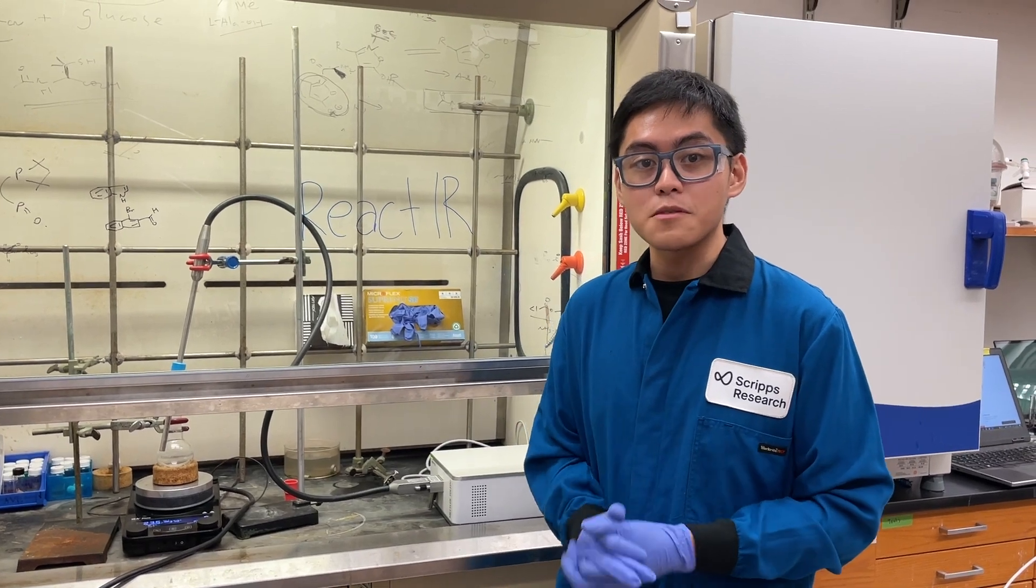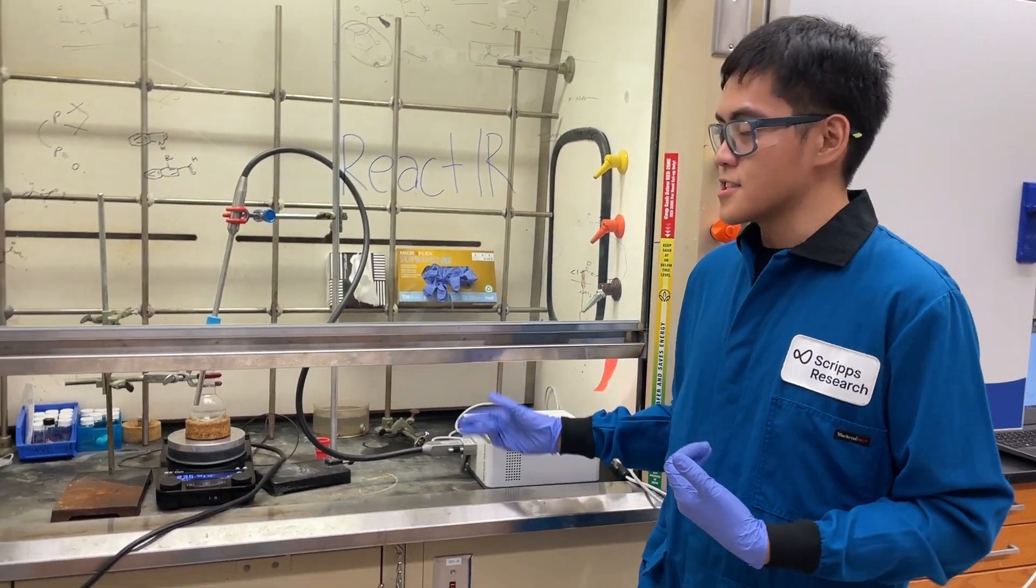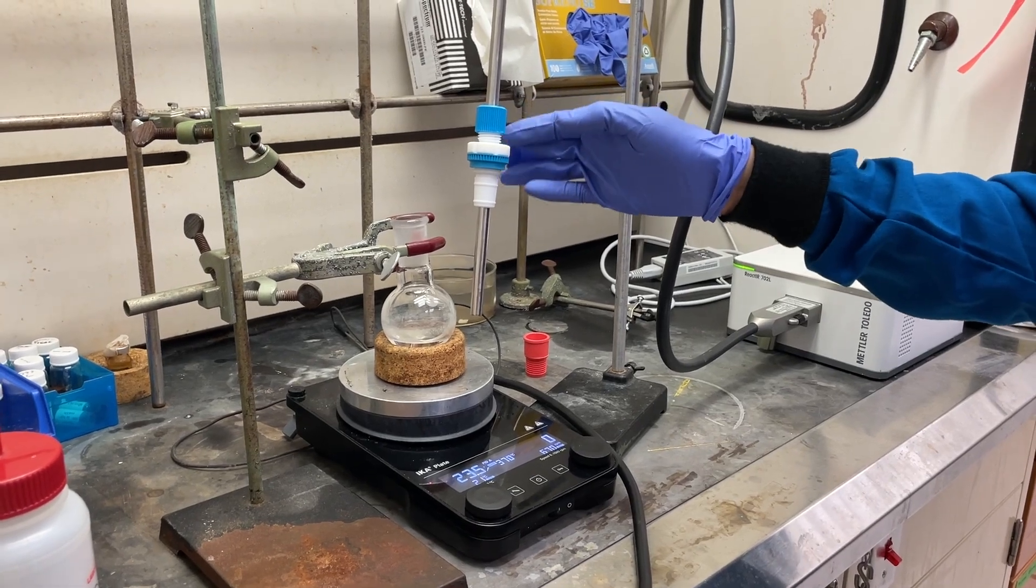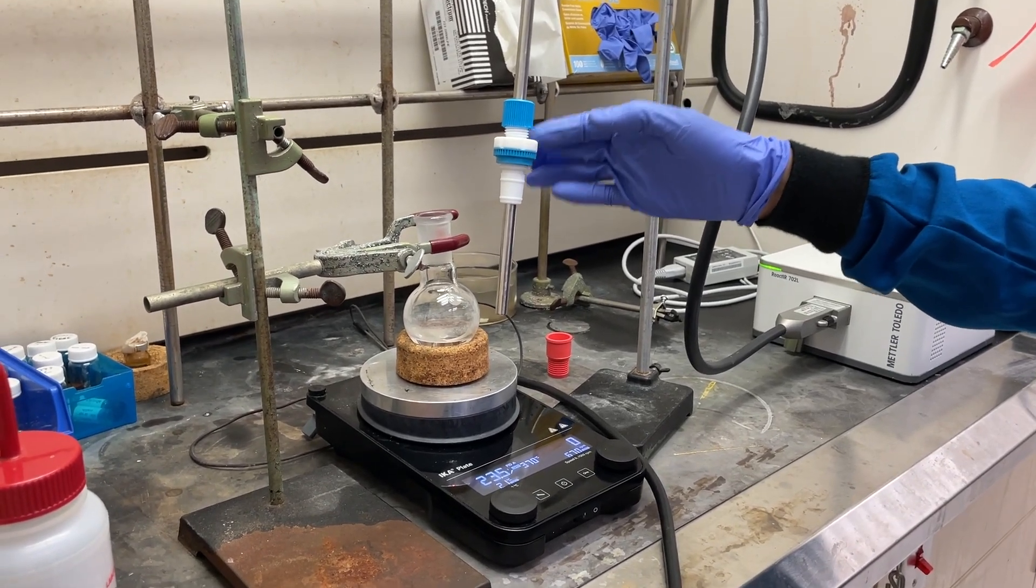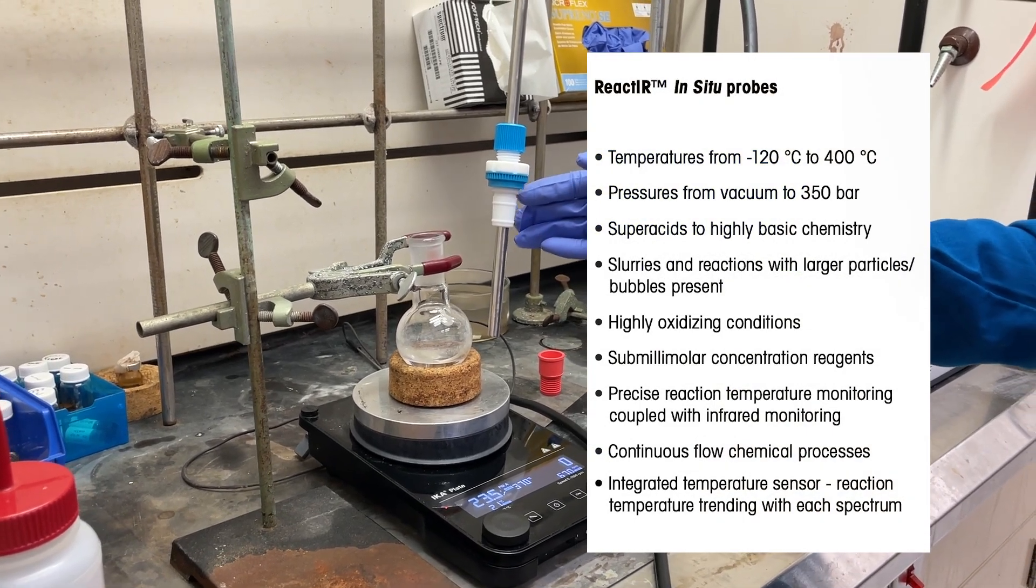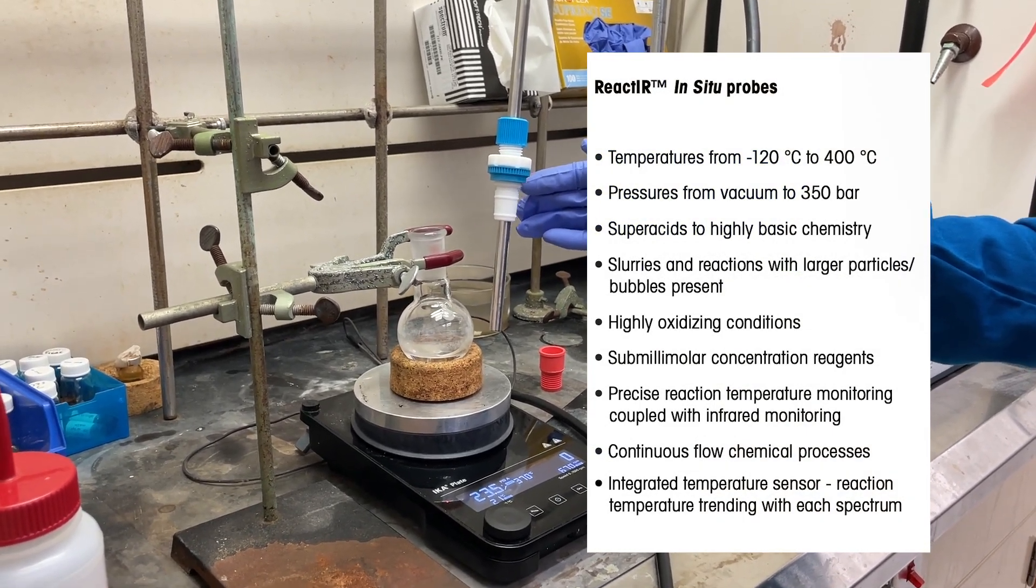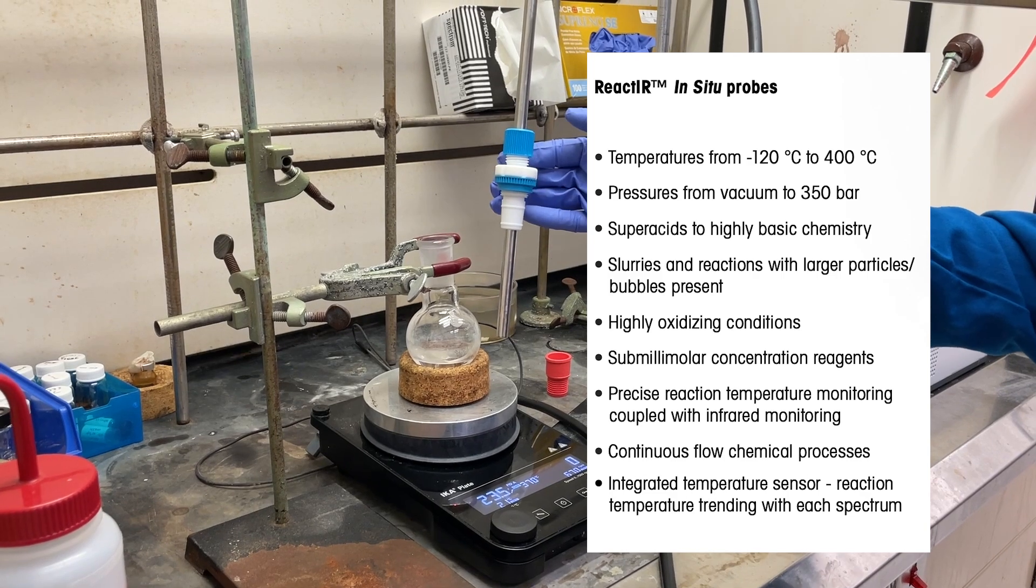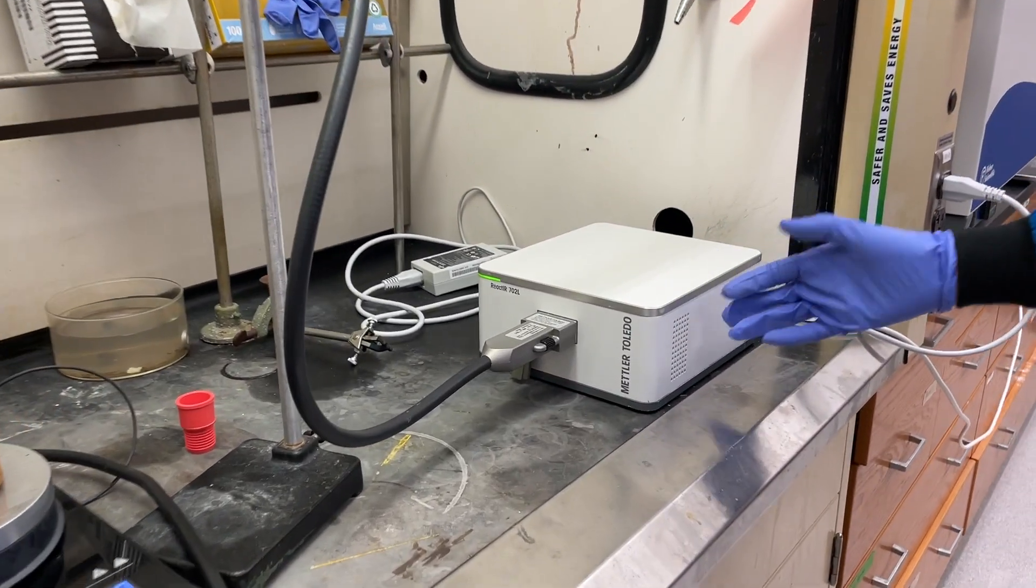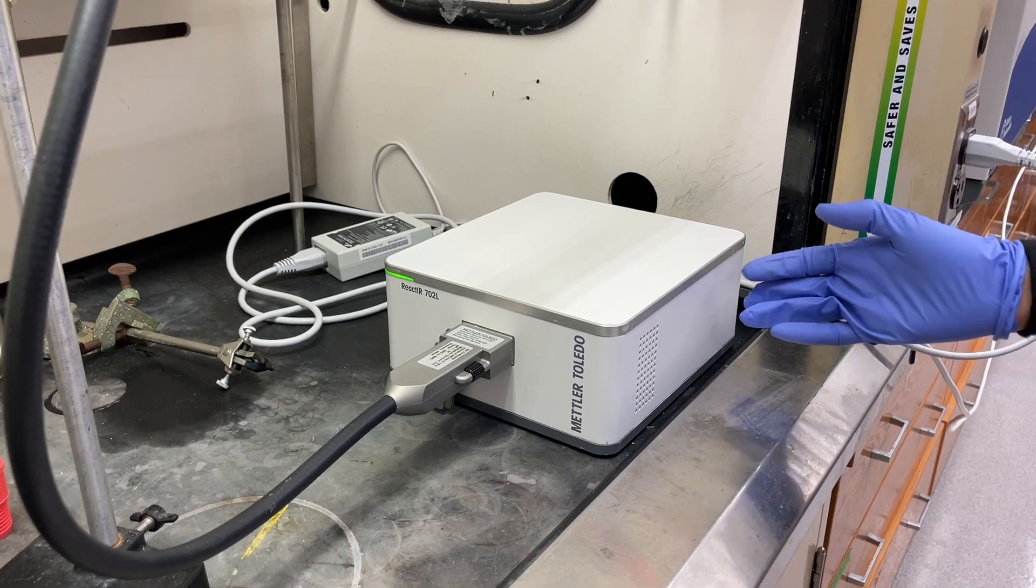So now let's go over the setup of the React-IR. First is the probe. This probe is designed to operate over a wide range of conditions: varying temperature, pressure, acidic or basic conditions, or oxidizing conditions, you name it. Just make sure to consult the manual. This probe is connected to a spectrometer that generates the infrared light that interacts with the sample through the probe.